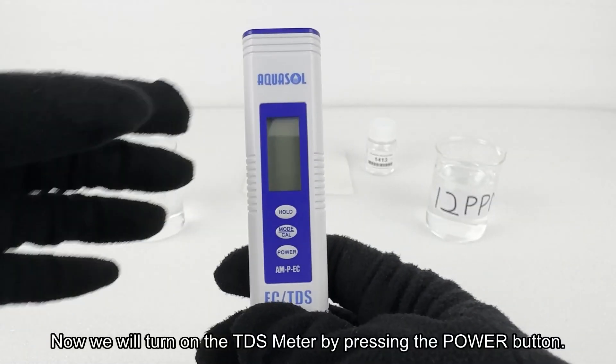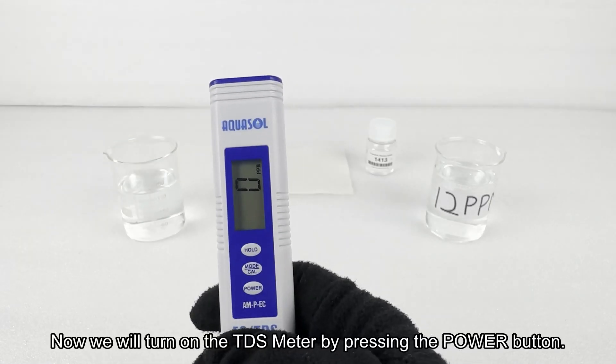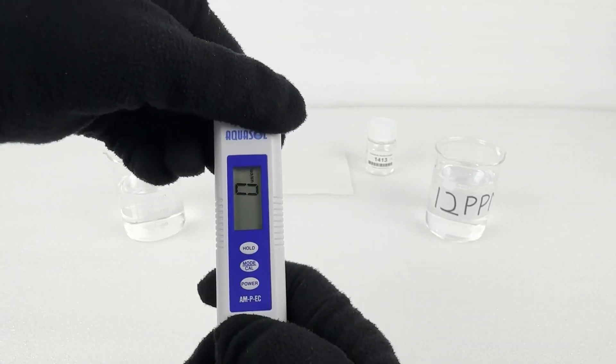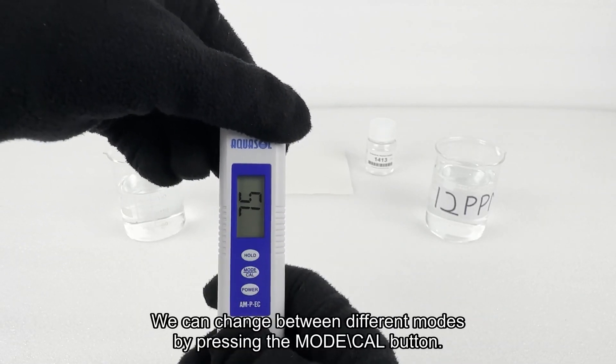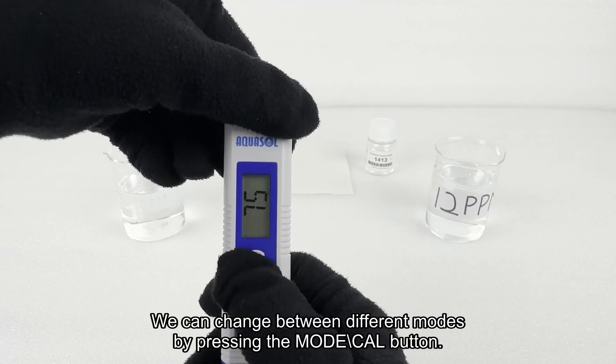Now we will turn on the TDS Meter by pressing the power button. We can change between different modes by pressing the mode backslash CAL button.